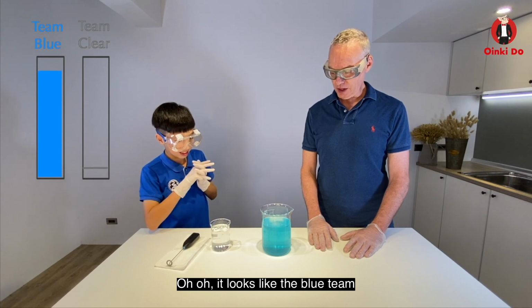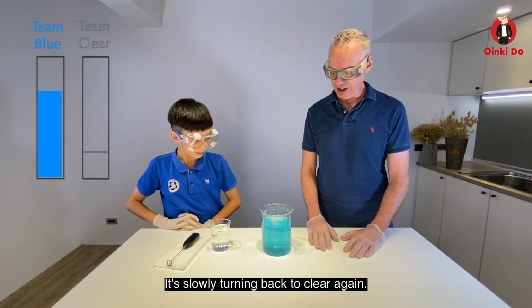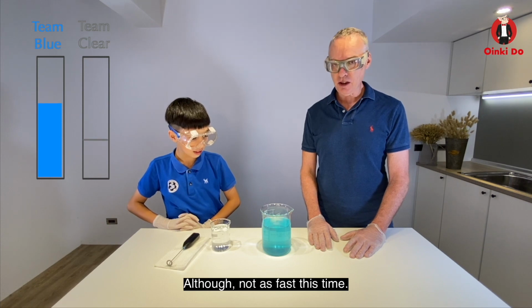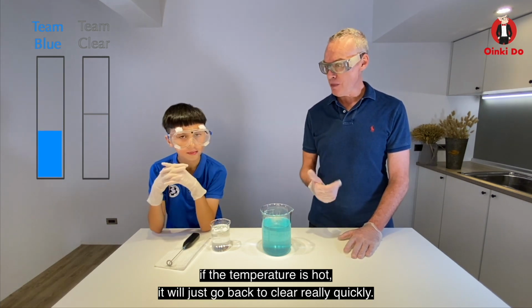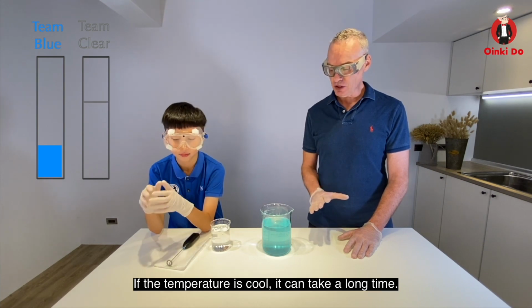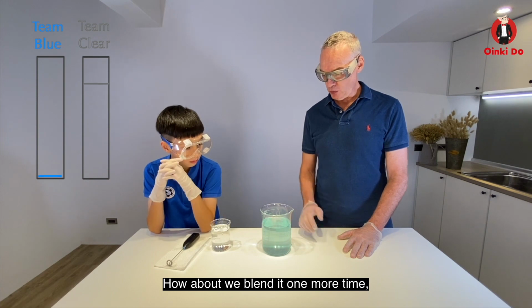Uh-oh, looks like blue team is just too weak though. It's slowly turning back to clear again, although not as fast this time. This one depends on the temperature. If the temperature is hot, it'll just go back to clear really quickly. If the temperature is cool, it can take a long time. So how about we blend it one more time.